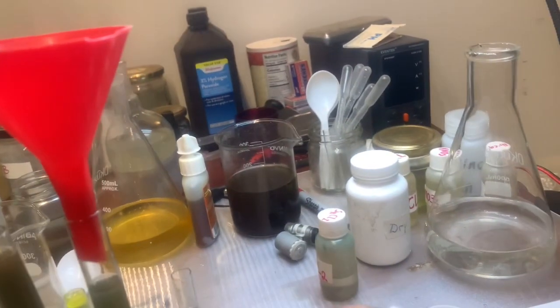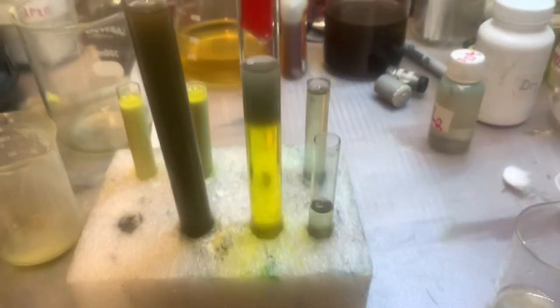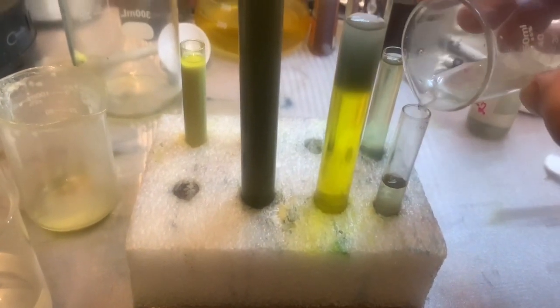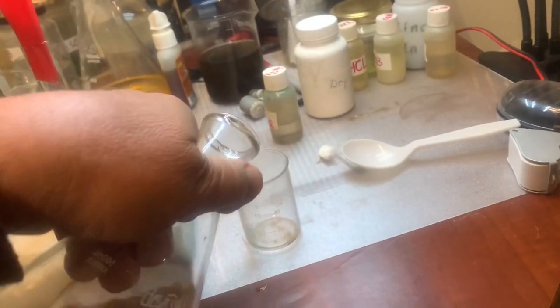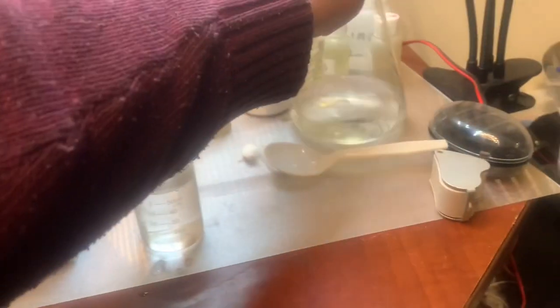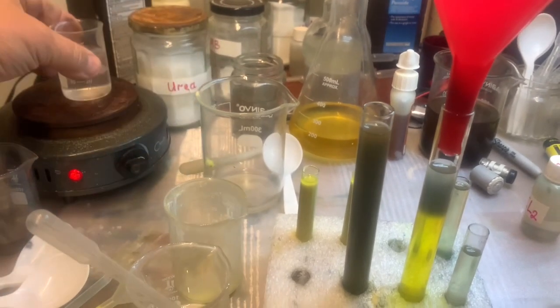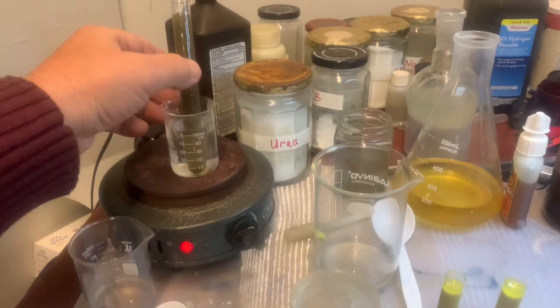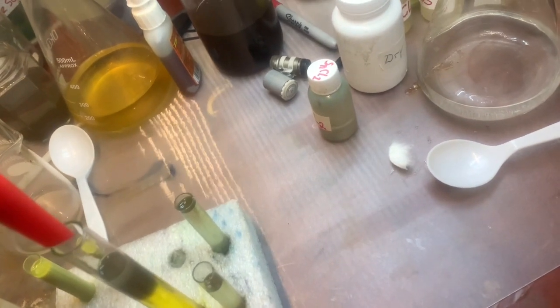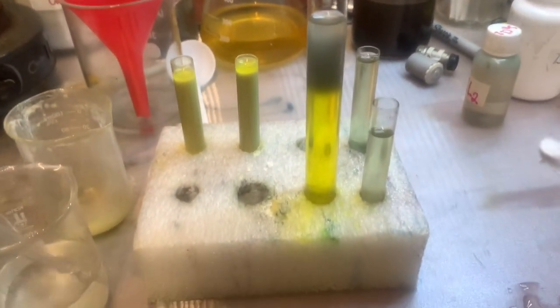So hydrochloric acid, let's put it in here. Okay, and now what I want is to add water and heat it. You know, when you heat, reactions go faster. So right now I'm putting in water, heating it up. I want to make it work faster. So I'm heating. And here, almost done. It's done, it's still there, but no gold, so forget it. Let's finish.